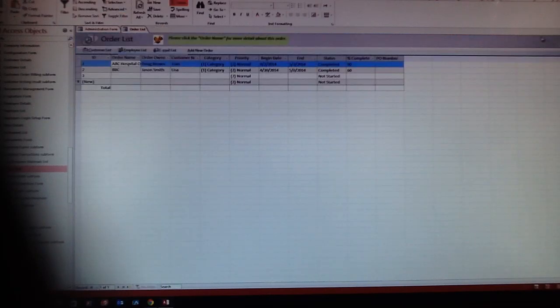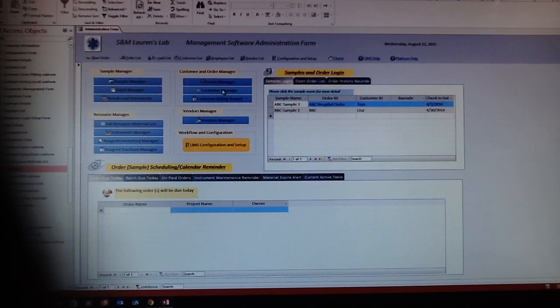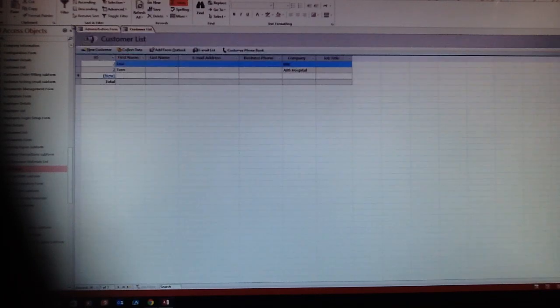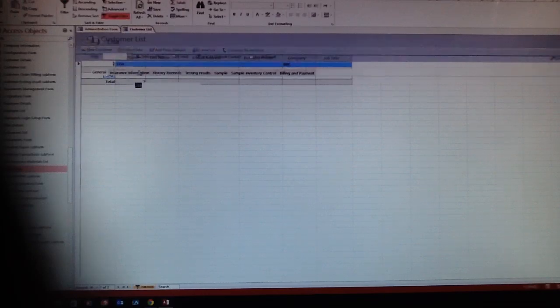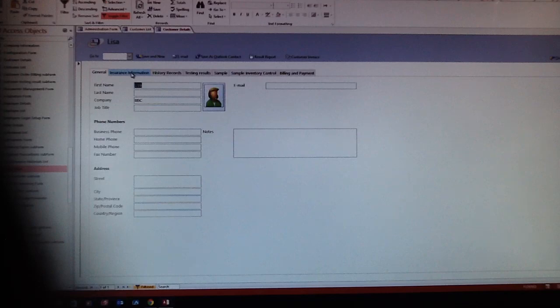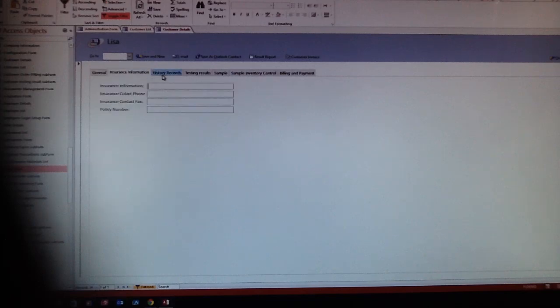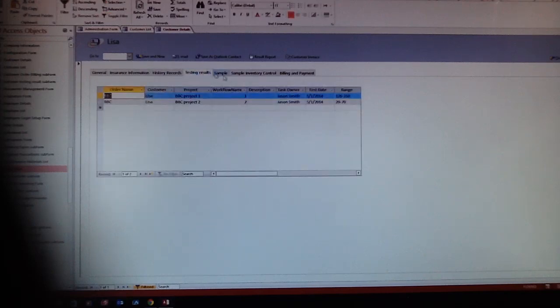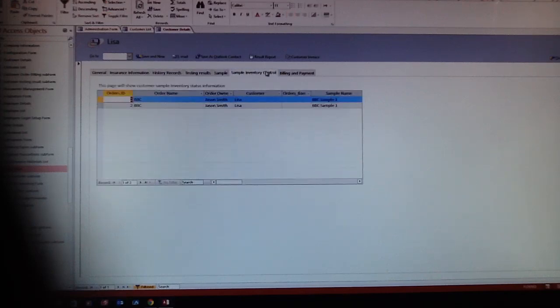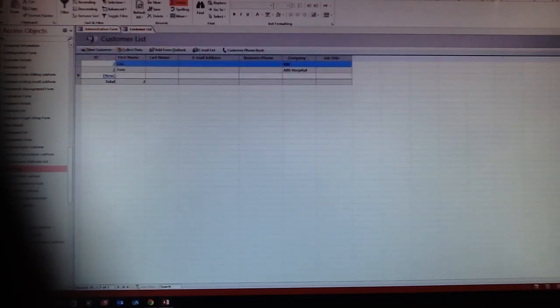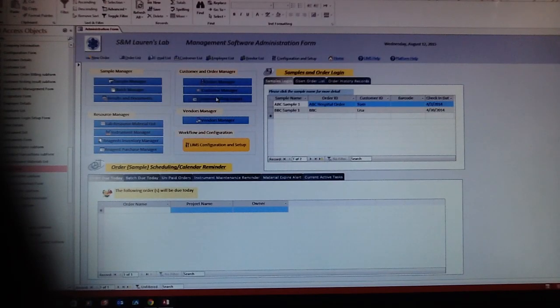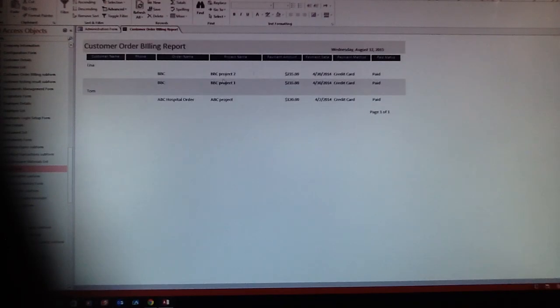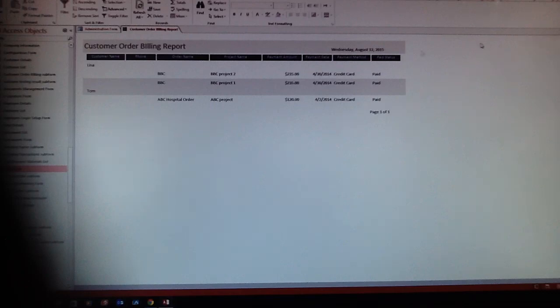After you start the order, you have to put in customer info on the customer list form so you can always trace it with the customer. That's the customer insurance information, history records, test results, samples, sample inventory control, and billing and payment information here. Here is the billing report: which customer, what kind of project, that's the billing status. If they pay it, if they don't pay it, they will show it on the report here.